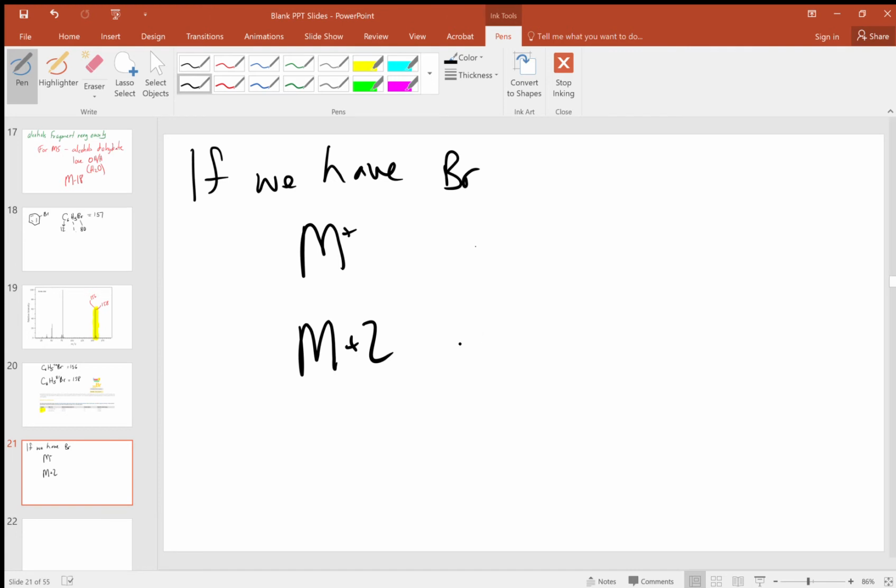is that the M plus 2 peak is about 98% of the M plus peak.